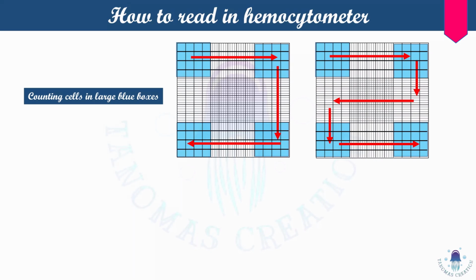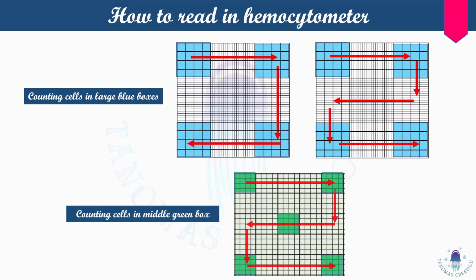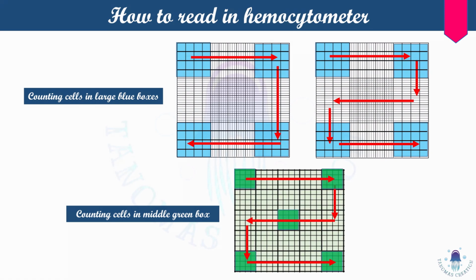In order to remember which boxes you have finished counting, and to avoid confusion, if you are counting the cells in the middle green box, you do the same thing, read it in a zigzag manner so that you can remember which boxes you have already counted. This is the most preferable pattern that is used for counting the cells in the hemocytometer.